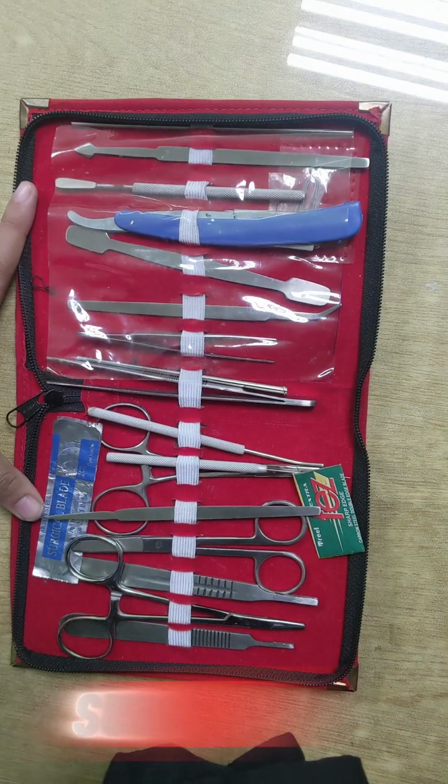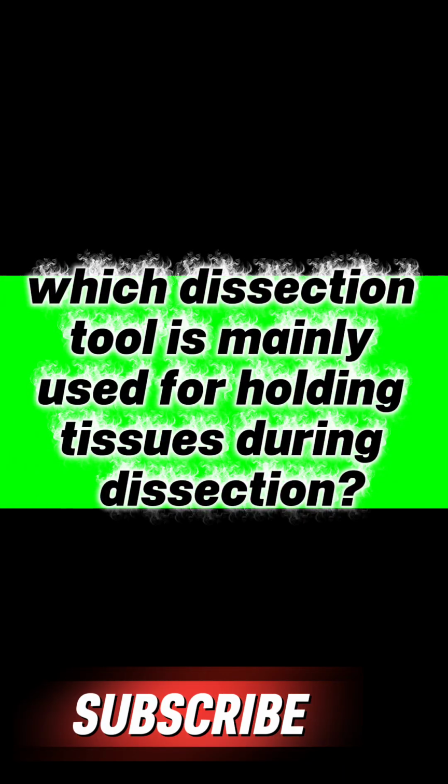Today we have learned about the scalpel, dissecting scissors, forceps, needles, probes, and dissecting pins.